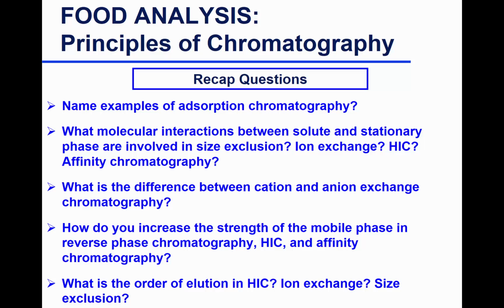What type of interactions are there in size exclusion chromatography? Size exclusion, what's the separation based on? Very good. So it is physical. You don't have molecular interactions, so you don't have adsorption to the stationary phase. The stationary phase is just a merely inert phase with particle pore sizes. So they go in and out. There's no interaction. So it's not adsorptive chromatography.